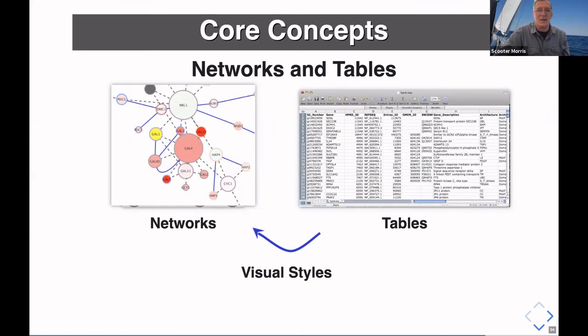Cytoscape has also been used by a science fiction author to keep track of the star maps for his stories, or for water distribution systems in cities. All of these are very far afield of what most of us think of as Cytoscape, which is a biological network visualization and analysis tool. There is no biology in the core of Cytoscape. All of the biology comes from apps, including some of the core apps and also apps provided by others.